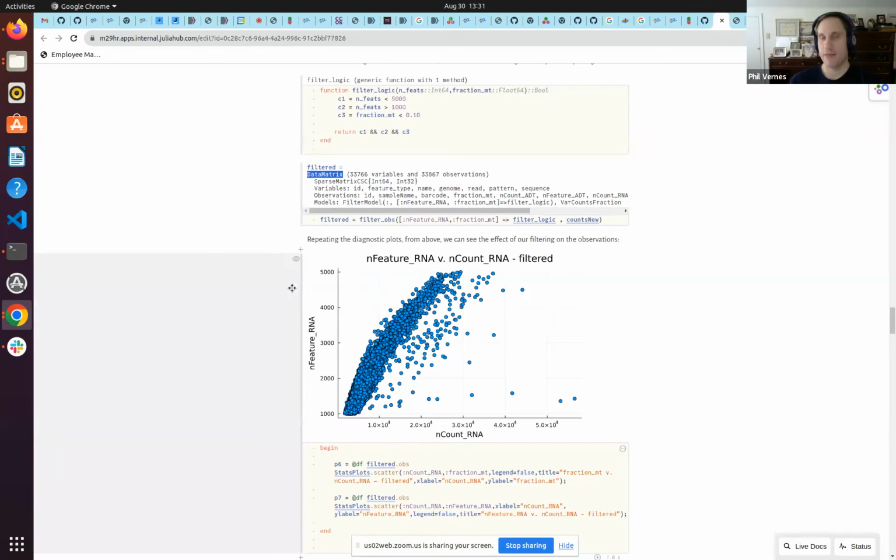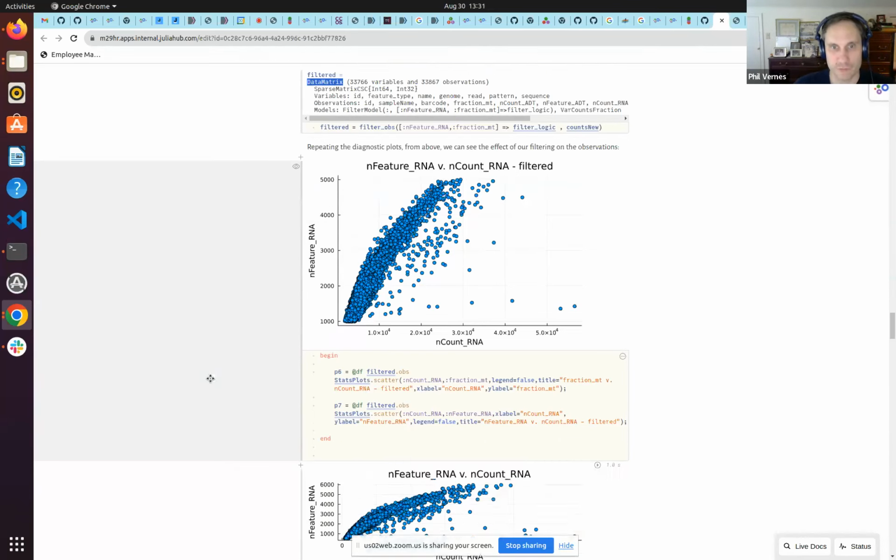Likewise, it's filtered. And that's also important, because when you run the code, you will have multiple dispatch on type, and because he did this very well, we are able to use the same generic code across the entire process. While we're filtering, normalizing, and transforming, we're able to still use the same exact API for the data matrix object. So it's a very logical abstraction.